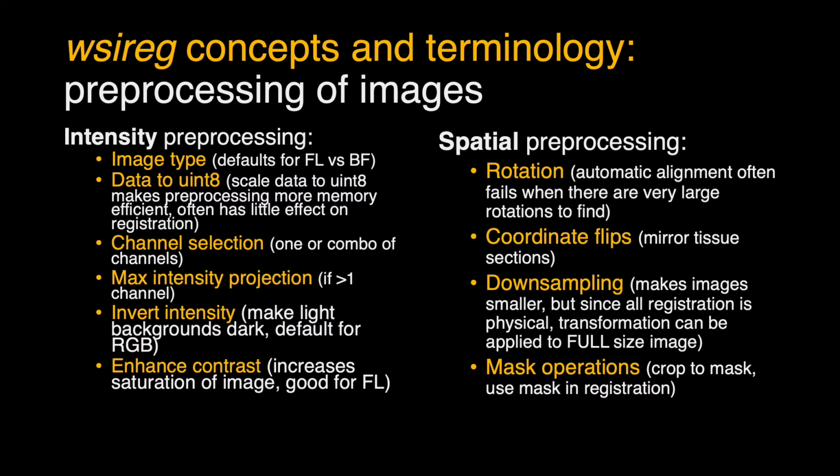So there's also channel selection. If you have multi-channel images, maybe you don't want to use all of the channels, because if you do, there's going to be a max intensity projection of those channels, but you really want the first channel or the second channel. So you can select that and just read in that image for registration.